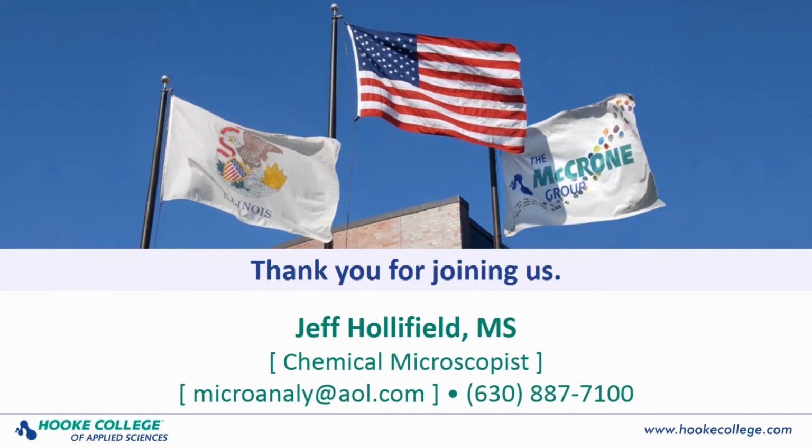In summary, a lot of information can be obtained from a very limited amount of material in trace evidence cases. If one knows how to properly utilize the advantages offered by the polarized light microscope, almost any particle can be either positively identified or characterized to the point that it is very clear as to what additional tests or techniques would be appropriate for subsequent analysis.